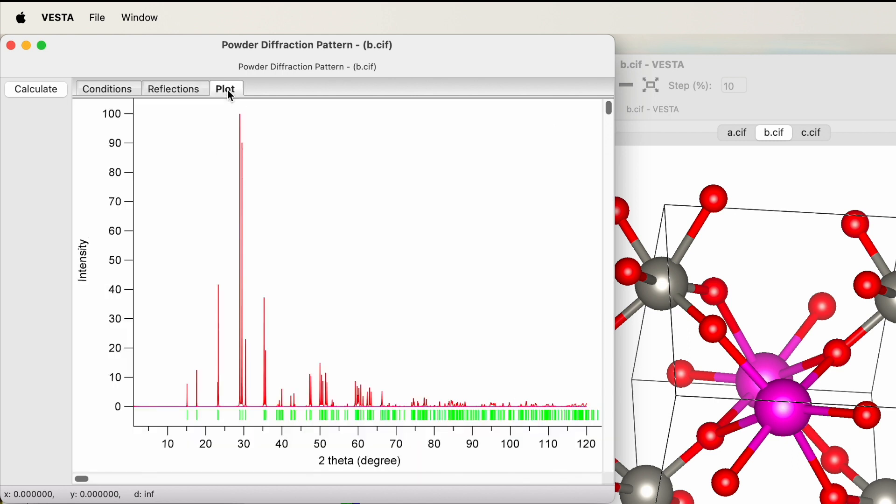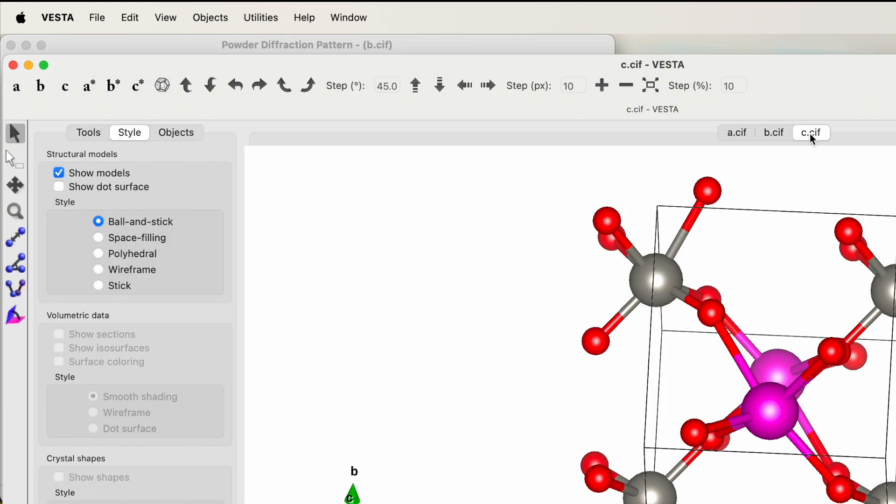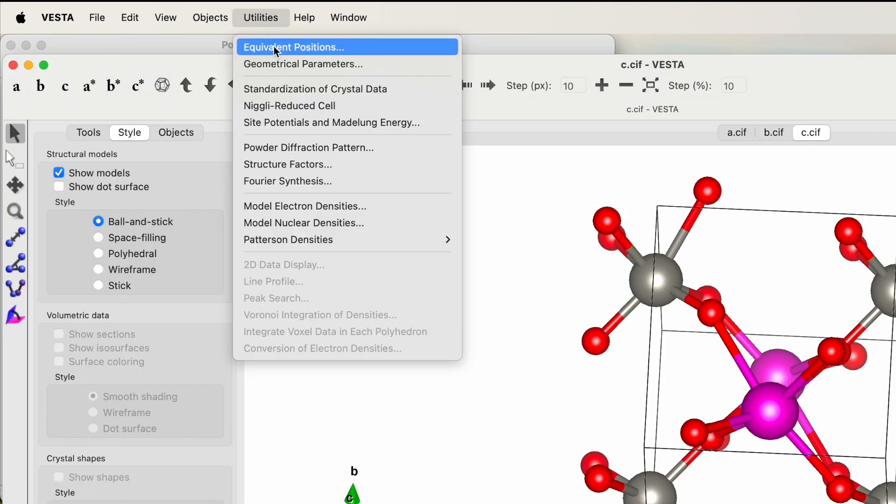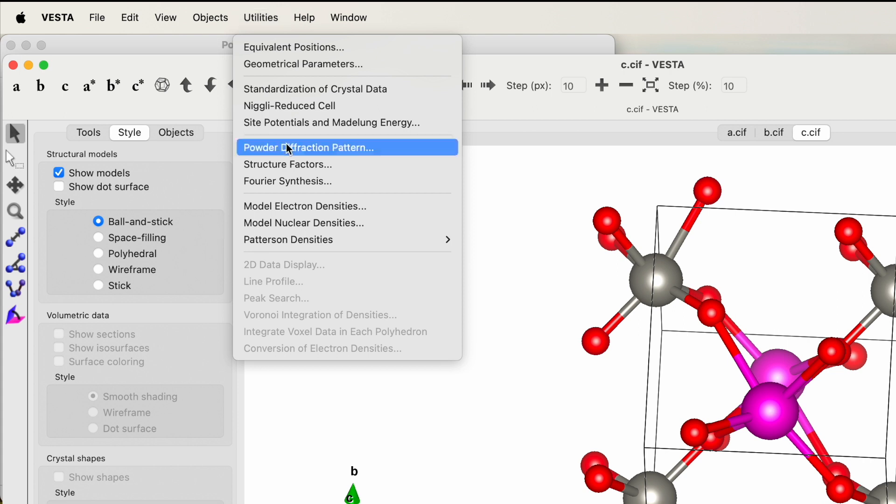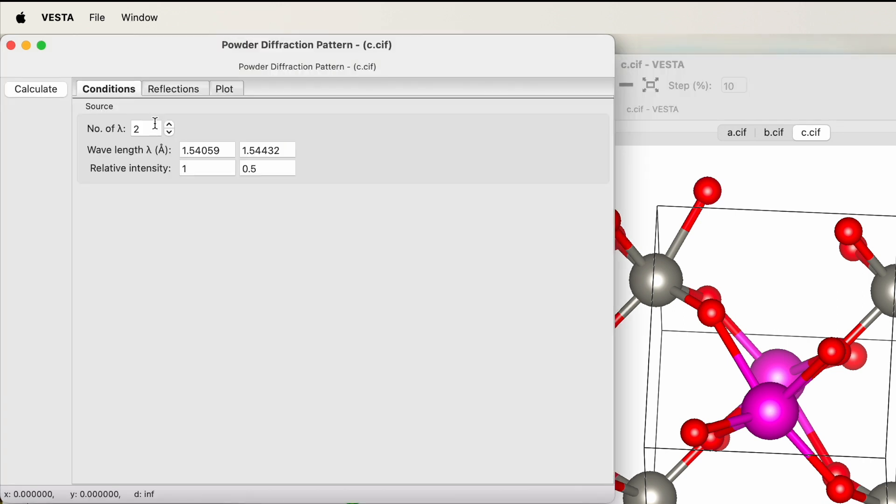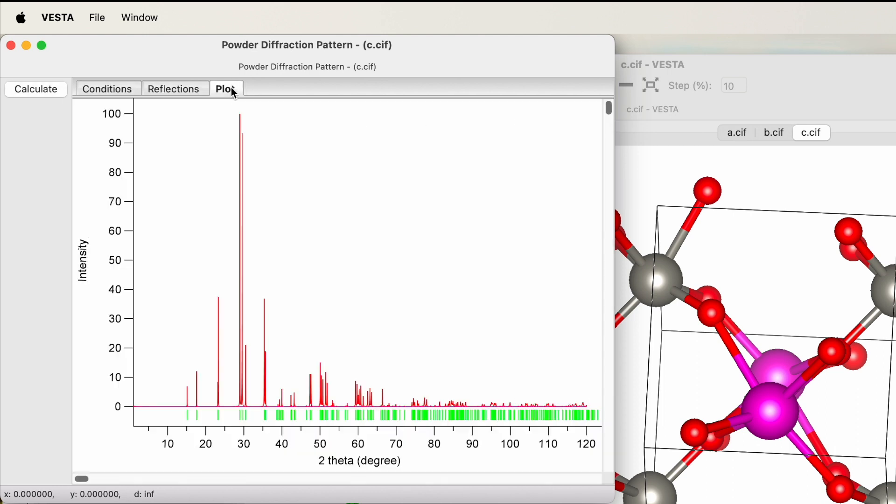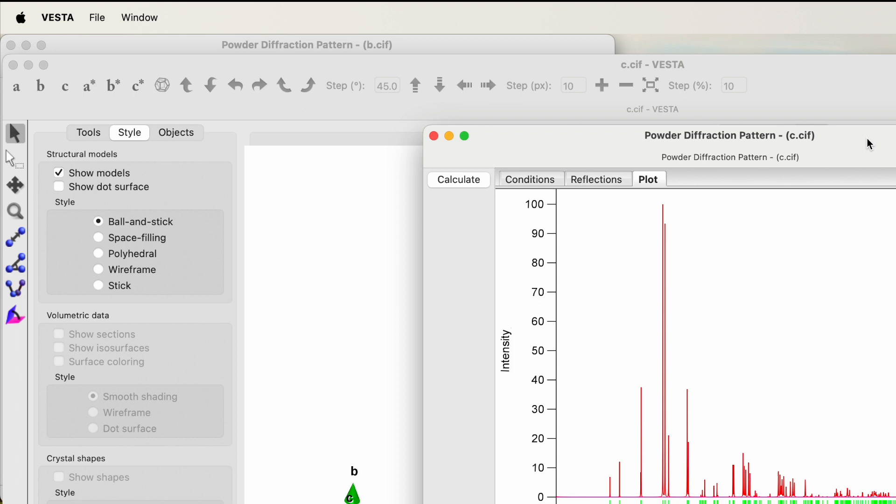Do the same for this third CIF file. Go to Utility, click on the Powder Diffraction Pattern, go to the condition and reduce it to one. Keep the same wavelength, hit Calculate. It will generate the reflection list and the plot.